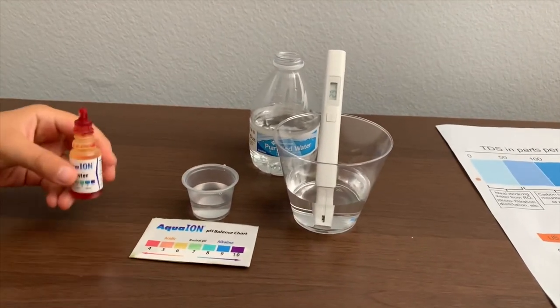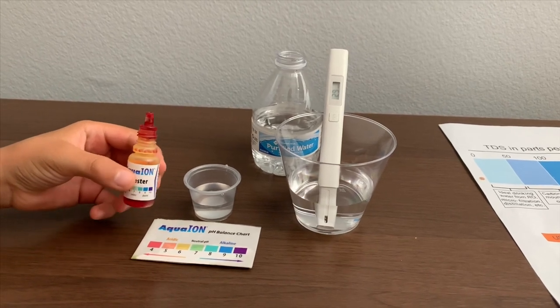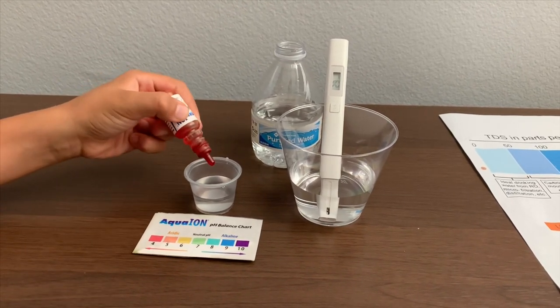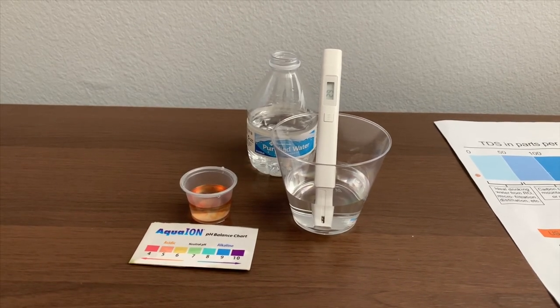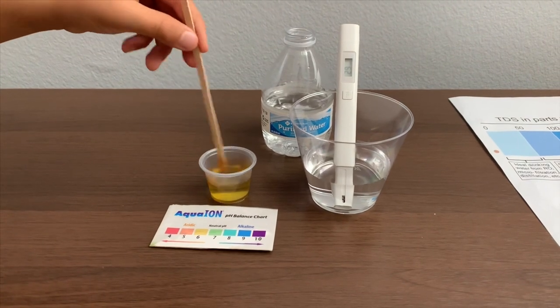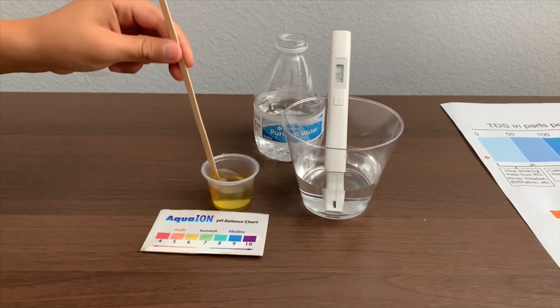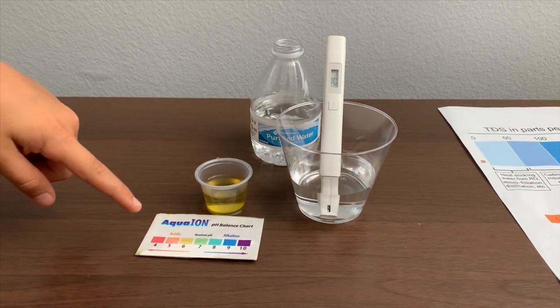Now let's test the pH level. If you want to buy this pH tester, check the link down below. Only do two drops. Let's stir it a little for a better result. I give this a 7, a 6.5. This is acidic.